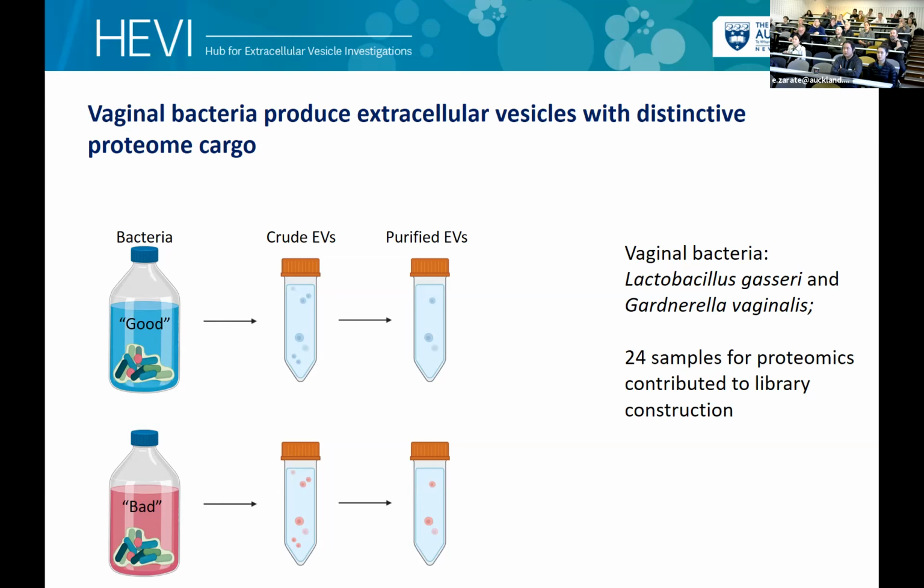We isolated vesicles from the two bacteria and we further purified them. We took samples from each of the groups for proteomics, and we were just looking for the protein profile in each group and whether there are some specific proteins being packed into these vesicles or not.